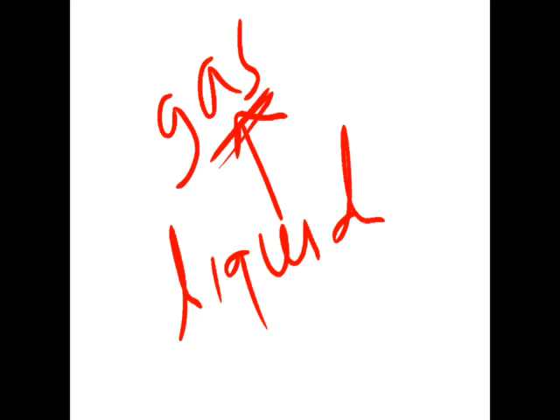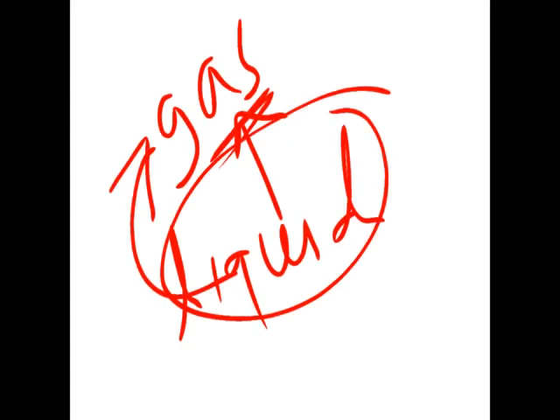There are different types of atomizers which convert the liquid sample into gases, and the most useful one is the flame atomizer. Are you getting my point? The principles are nearly the same. What is the first step? We have to convert the liquid into the gaseous state, or neutral gaseous atoms. For that we require an atomizer, and the flame atomizer is mostly used in atomic absorption spectroscopy.